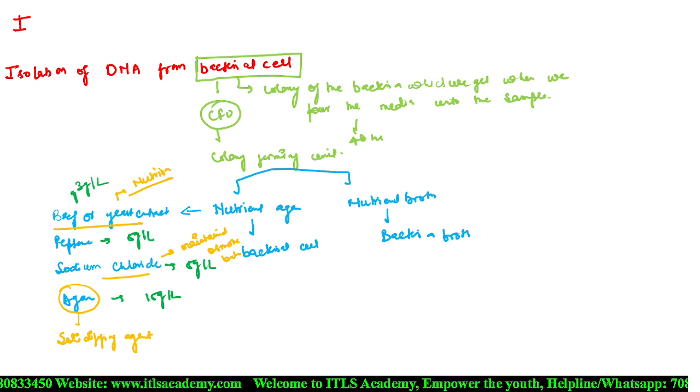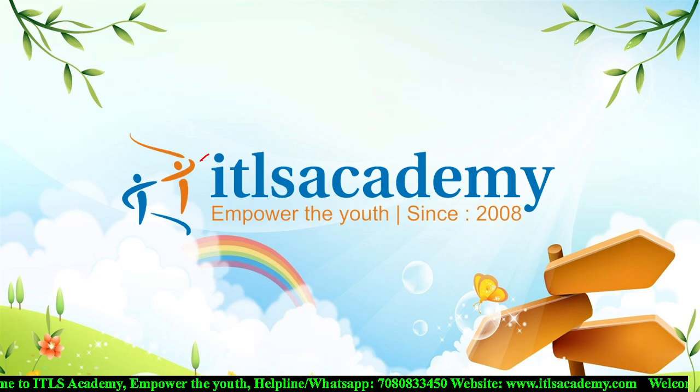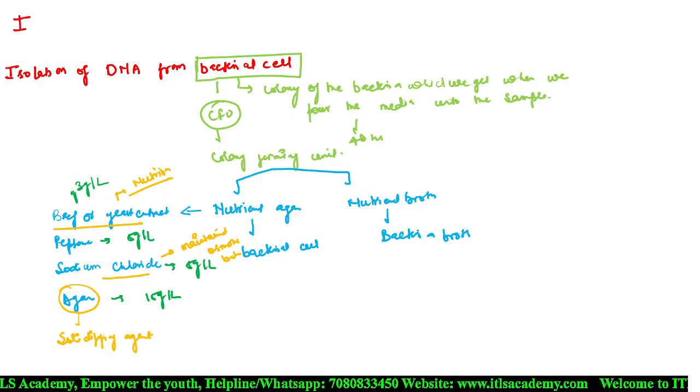Now the only difference between the nutrient agar and nutrient broth is the presence of agar.